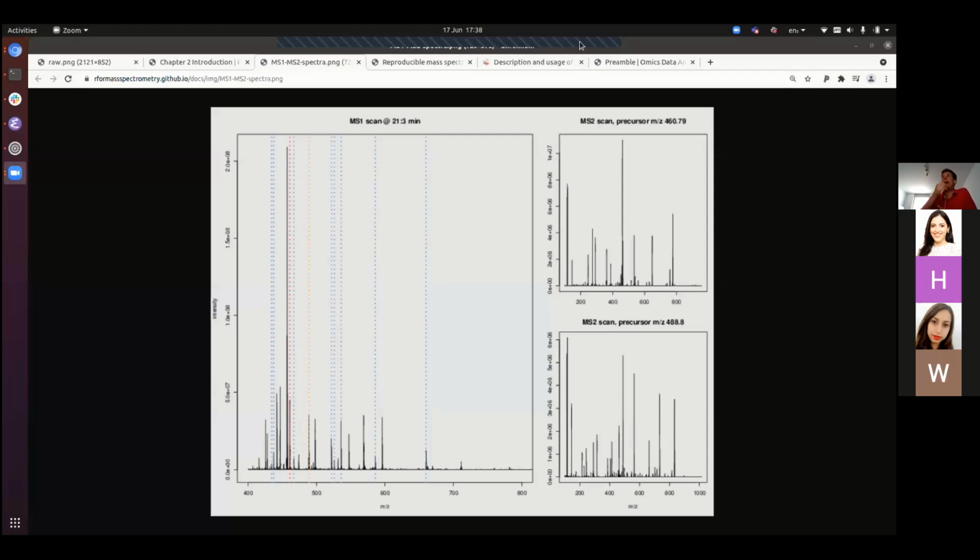I'm certainly not an expert in chromatography, but typically there is a trade-off between the length of the column and how much time you want to invest to acquire data.